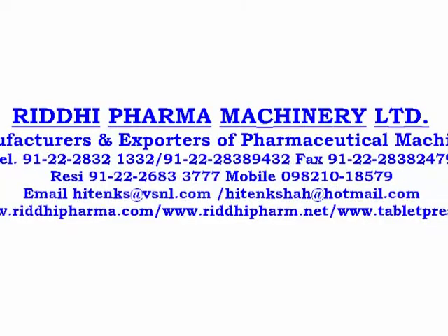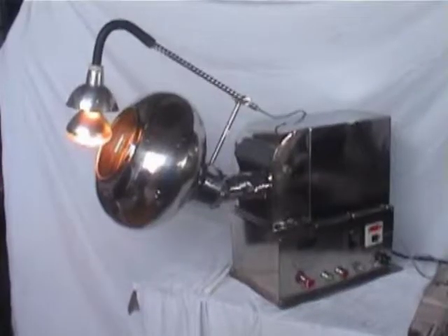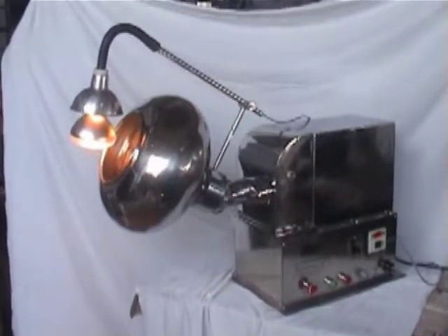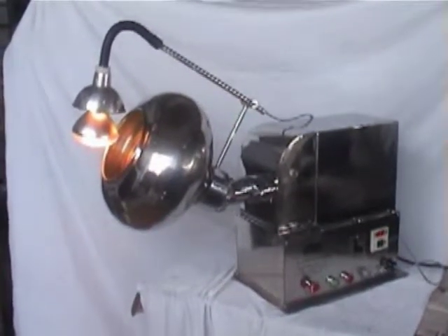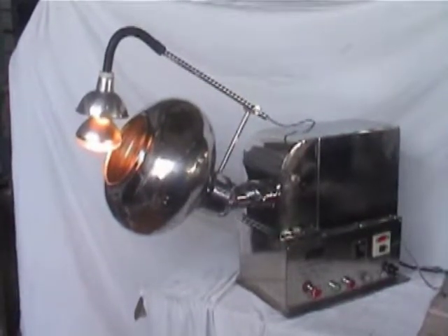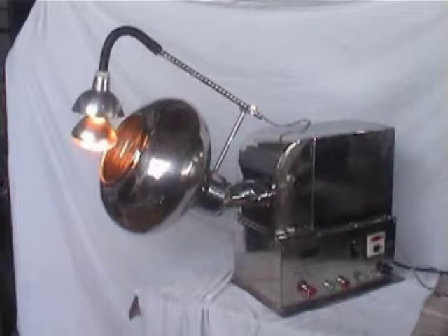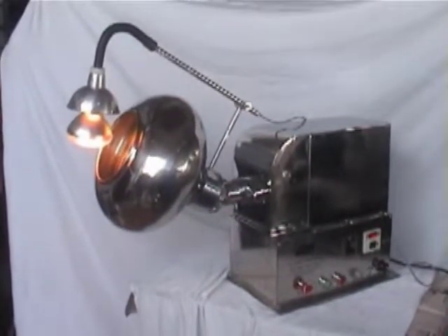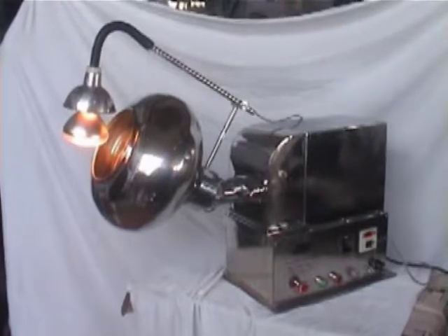This pan we have manufactured can house 3 kg of tablet. You are seeing the lamp which is given for drying. You can spray the solution and this lamp will give the drying effect.